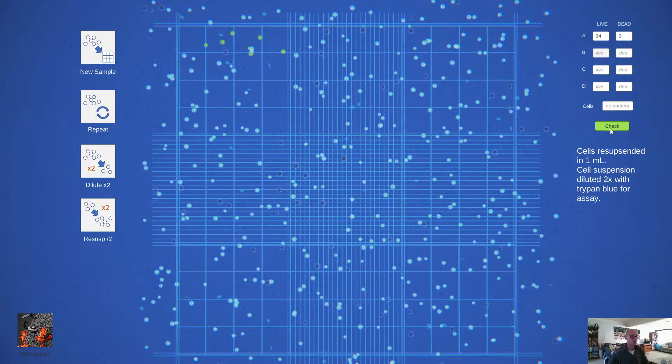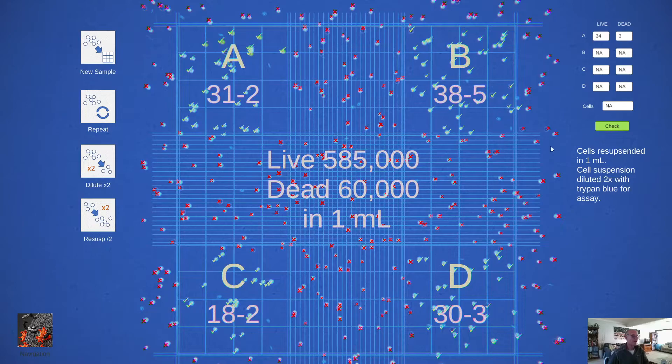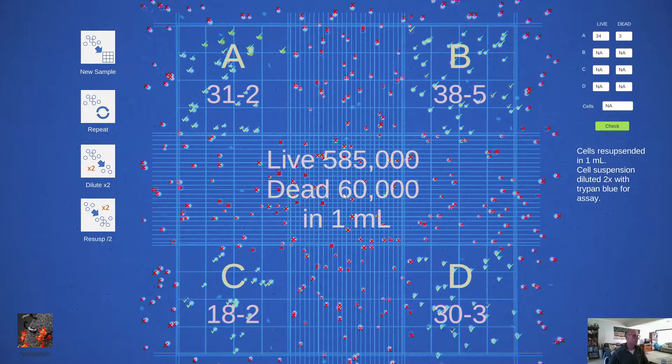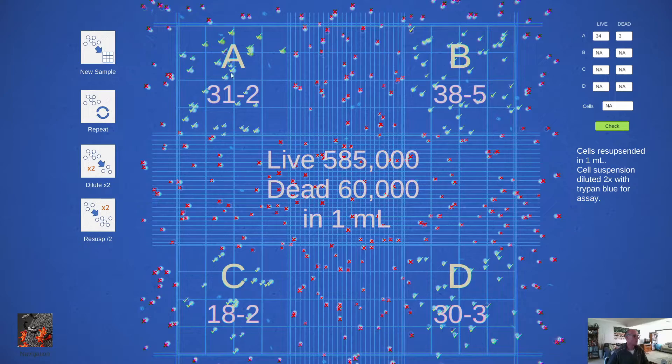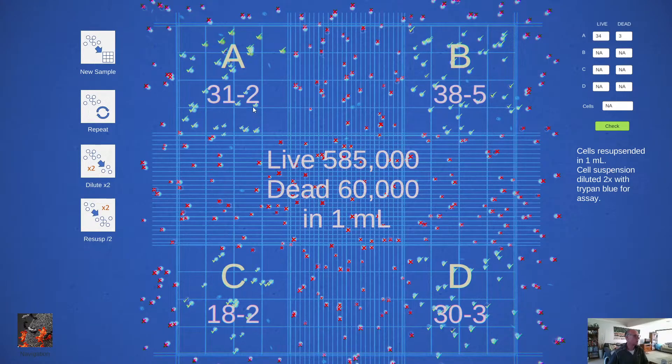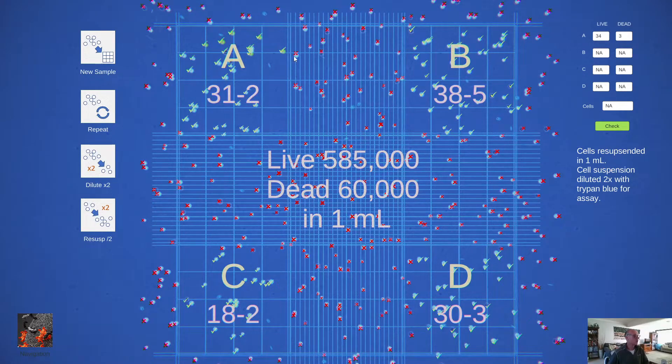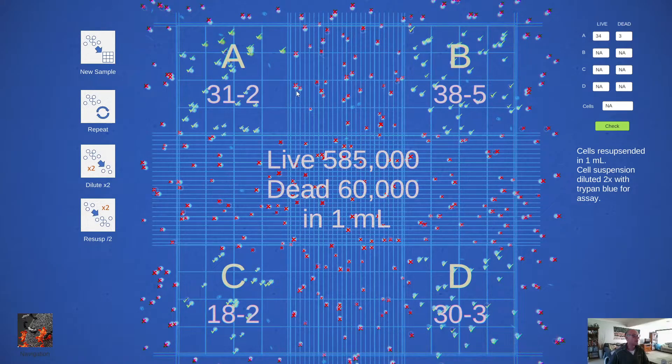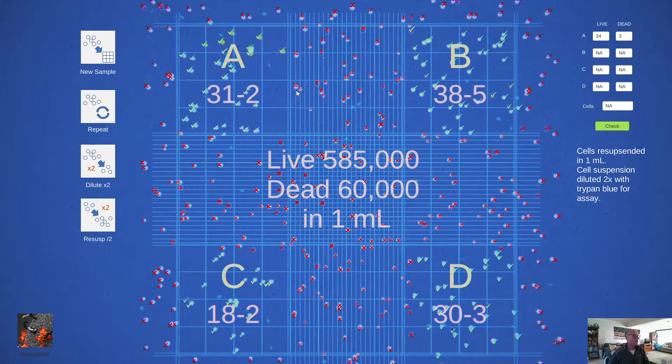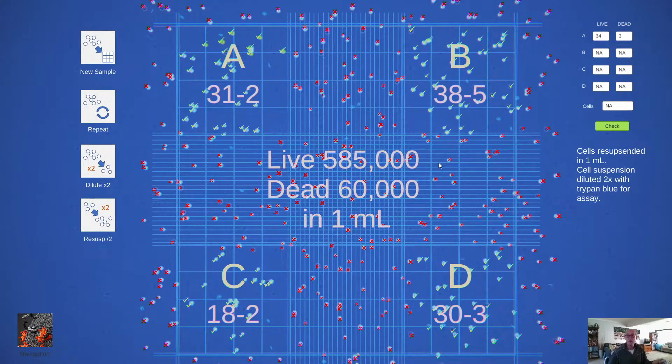Then I can check and what the computer will do is it will actually tell me how many live and dead there were in each quadrant. And it will show which ones it thinks are in or out of the borders.